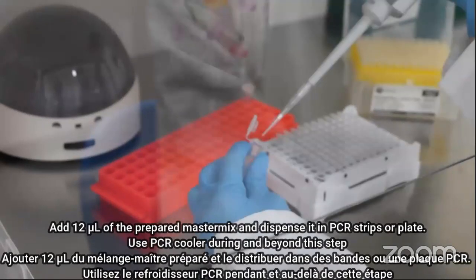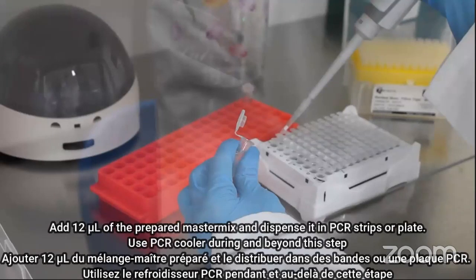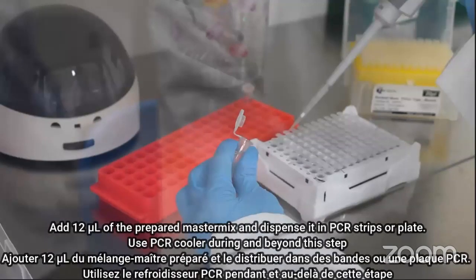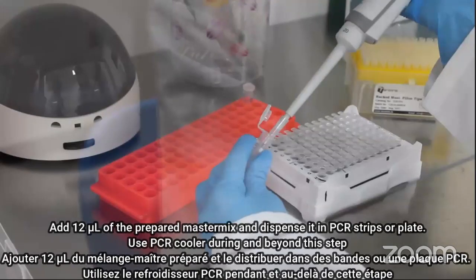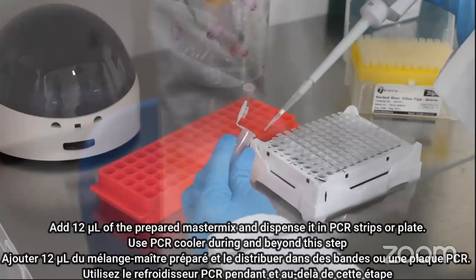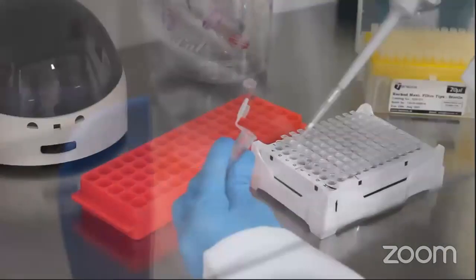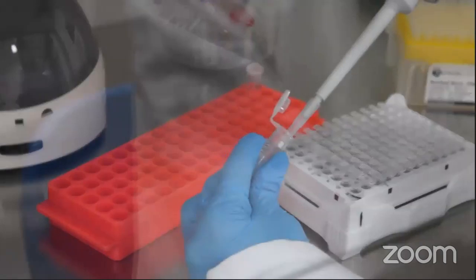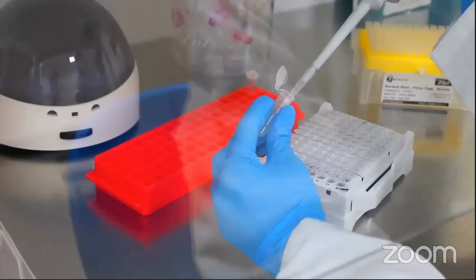You always use PCR cooler during and beyond this step because this mixture is sensitive to temperature and light. So you have to be careful with temperature. And while you are pipetting for 96 samples, it will take some time. So the temperature of the master mix will increase, and which can actually hinder with your process. So always use PCR cooler.